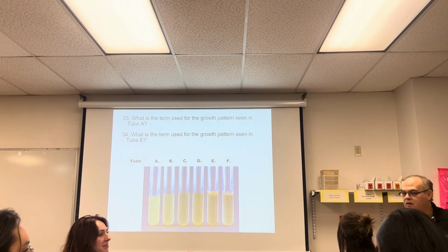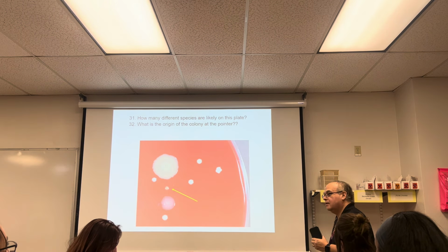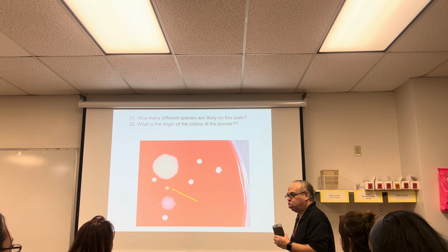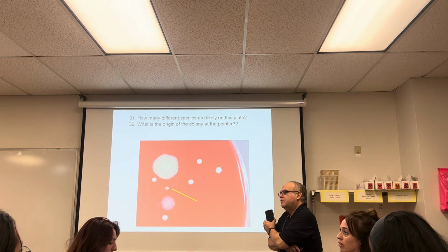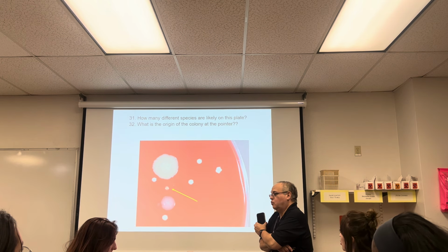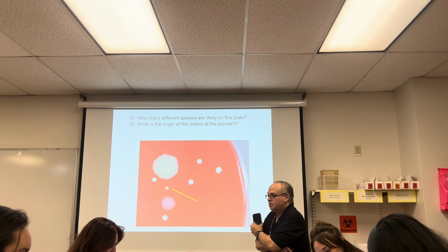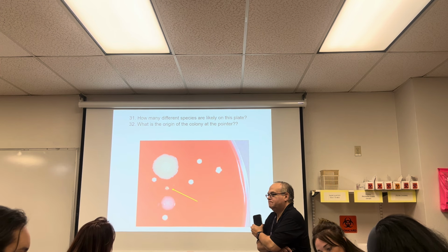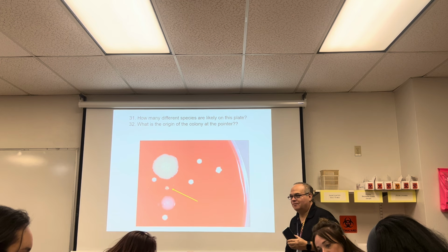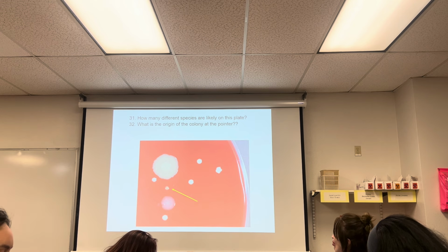Can you go back? I don't think we did 32. Yeah, that was the origin of the colony. Oh, okay. What is it? Oh, that's a pointer. Is it from water, because it's orange? To me, it's from water. But listen, again, you guys are bringing up things I didn't consider. So to me, if that's orange like that, if you said animal, it's acceptable. Okay? You okay? You're making faces at me.